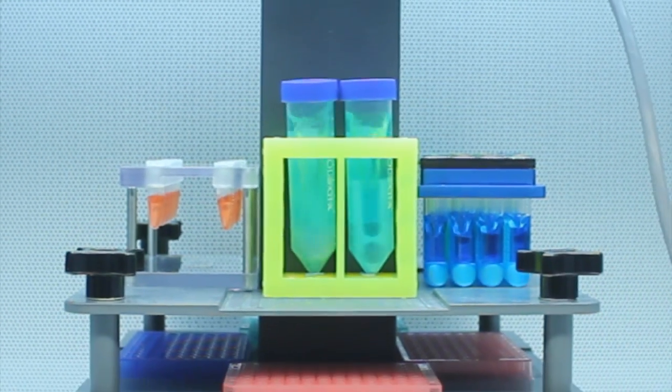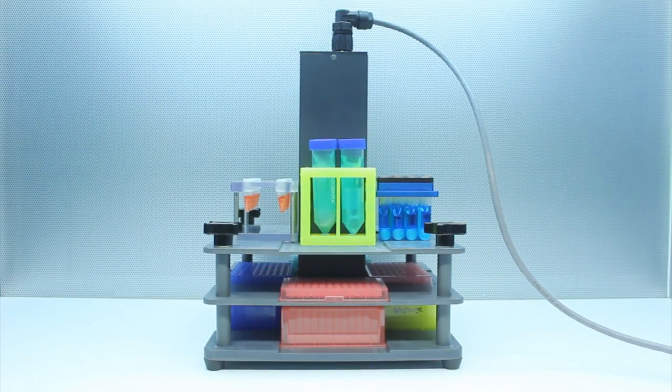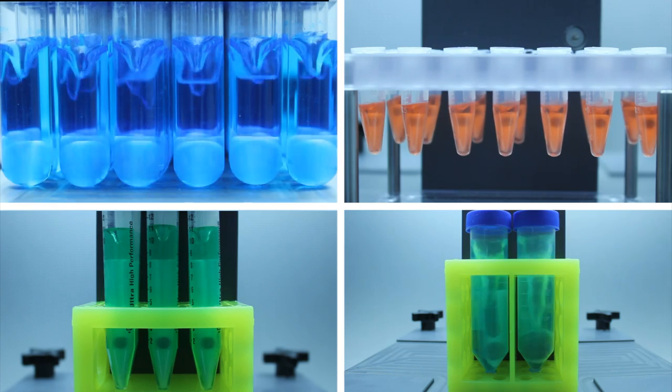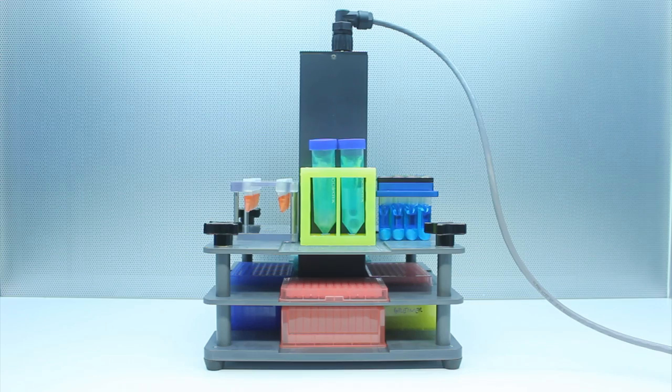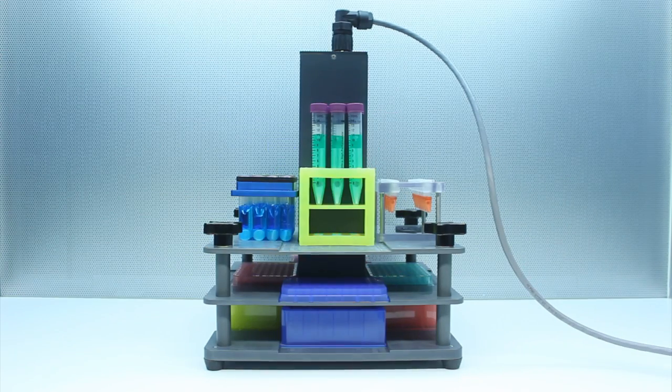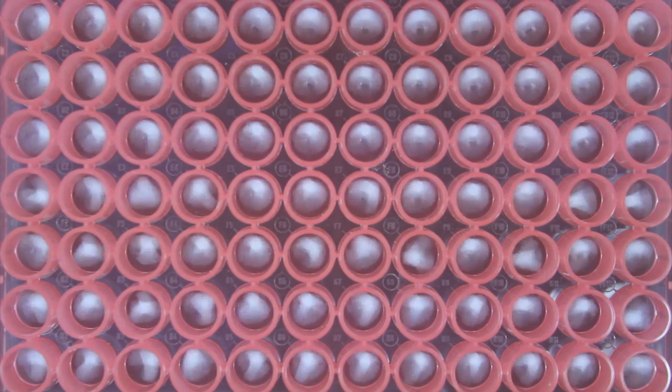When used with the lateral vortex rack to be held in the upright position, the tumble stirrer can be used to stir many different types of containers all at once. In this orientation, multiple standard and deep well microplates, racks of tubes and vials of a wide range of sizes can be mixed simultaneously.